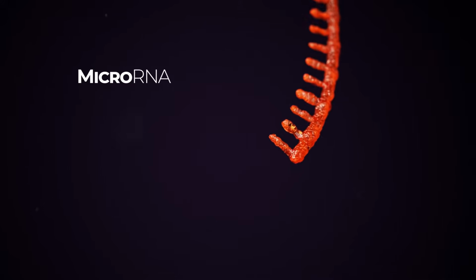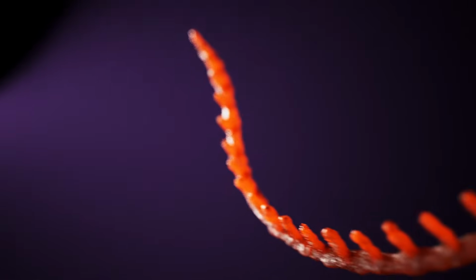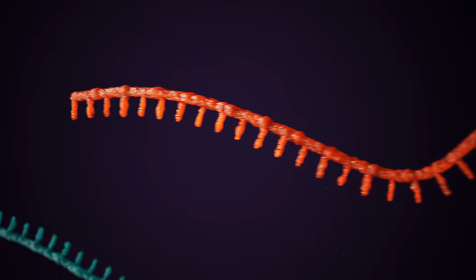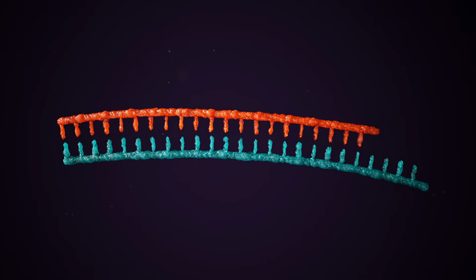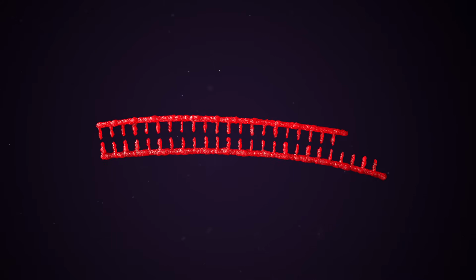MicroRNAs are short, single-stranded, non-coding RNA molecules that regulate the activity of messenger RNA. A microRNA molecule is typically 20 to 24 bases long, averaging 22 bases, much too short to encompass standard PCR primers, which tend to be roughly of the same length.